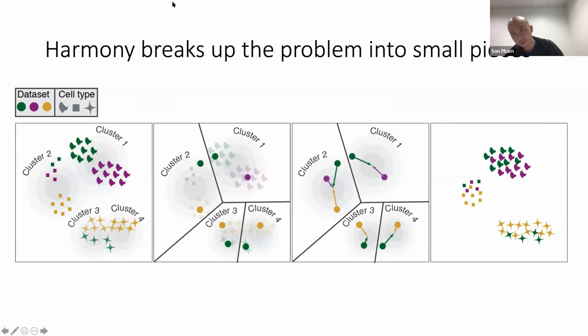Yeah, there's a question from an anonymous attendee. How to decide how many clusters? Yeah, that's a very good question. Maybe one or two more questions, and we can move on. There's a certain range of cluster numbers where you get very stable results. I'll give you an example of extremes. I think this is where it's very useful to know.